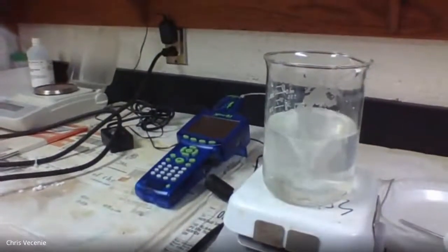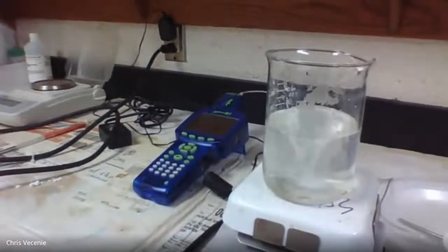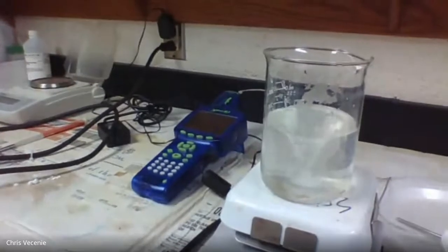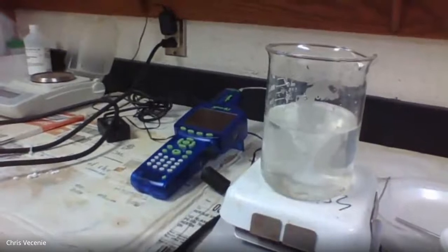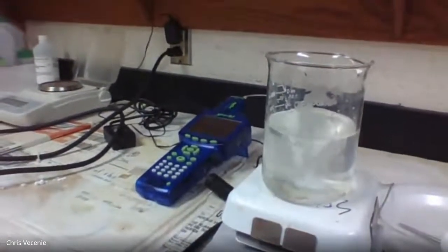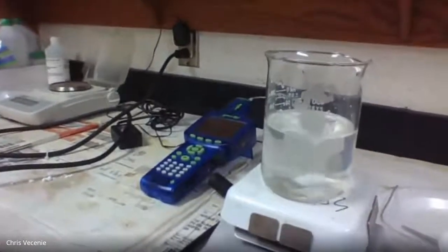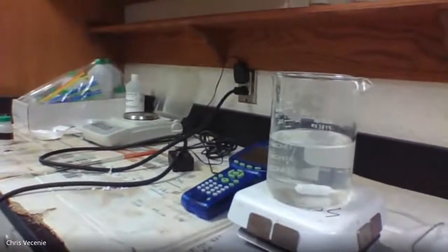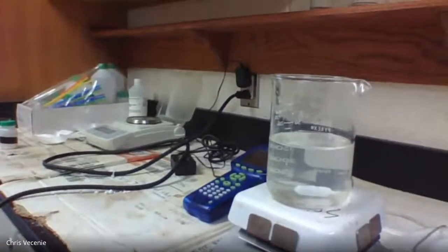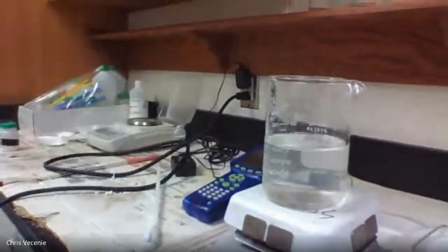All right, using my stir bar to get that calcium, to get that unknown carbonate to dissolve. All right, it looks like we're getting close, so I'll go ahead and turn that off. And then I will reach in with my stir bar retriever, grab the stir bar out, set that down. And now we're headed back out to the lab.